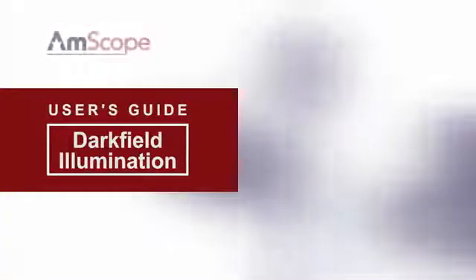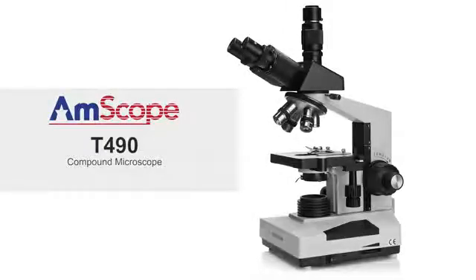This video focuses on Darkfield illumination. For this video, I will be using a T490 microscope. Darkfield illumination is a lighting method used to increase contrast in low-contrast samples.